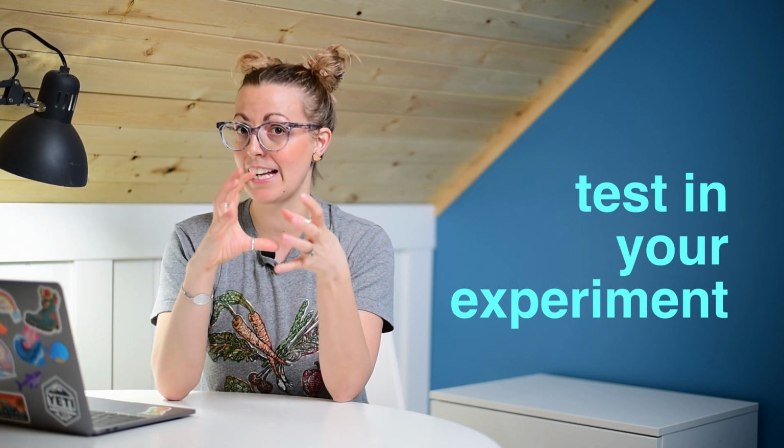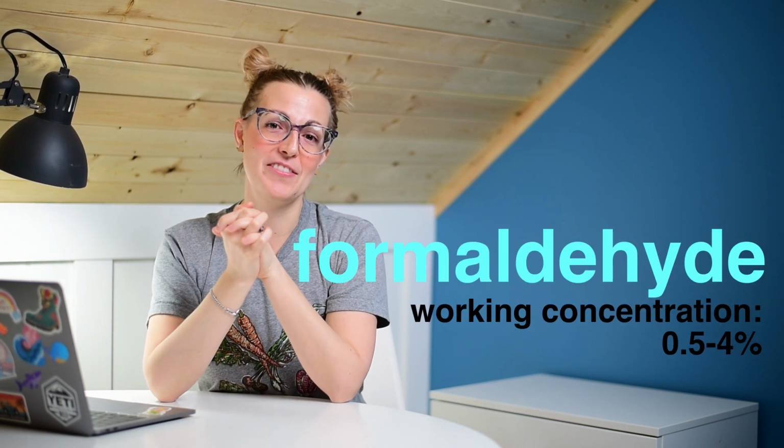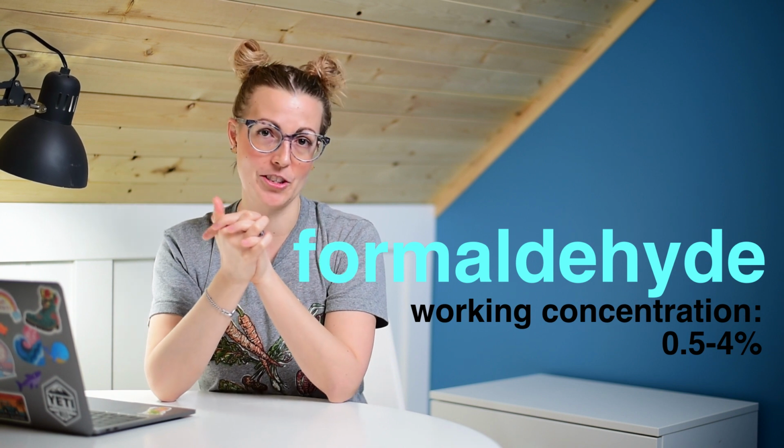Aldehyde fixatives work by cross-linking lysine residues, so basically cross-linking your proteins together and locking them in place. Because of this, you don't have as many structural changes as you have with ethanol, and so more of your protein structures will be maintained, allowing you to stain sometimes after you've fixed. Again, you'll need to test this with your specific antibody-antigen combination. However, generally speaking, aldehyde fixatives are good for proteins, bad for DNA. Generally, formaldehyde fixatives are used at about a 0.5 to 4% concentration. So like everything else, you will need to test to find the appropriate concentration for your experiment.